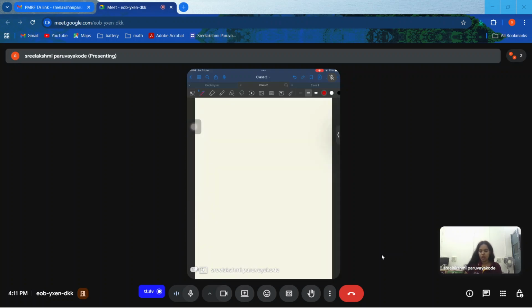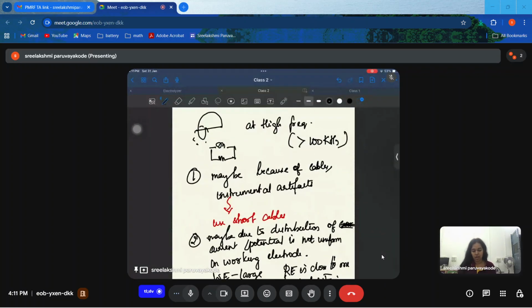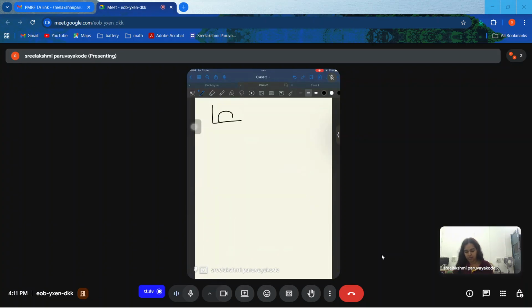Okay, now we are doing impedance. What do we get from the impedance? We have both the high frequency regime and the low frequency regime, right? Say this is the circuit. I have high frequency, I have low frequency. Usually the high frequency regime gives information about, this is very important, you can expect questions, the double layer capacitance. So the impedance arising from the double layer capacitance is provided in the high frequency regime. The low frequency regime talks about kinetics and mass transfer.